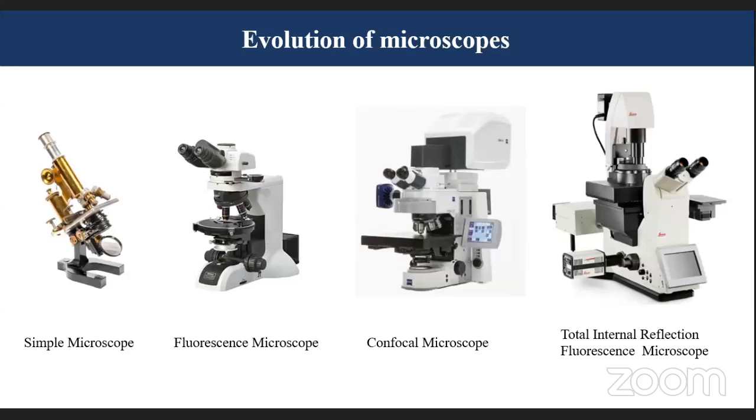In order to refine it further and reach higher axial resolution and spatial resolution, more advanced microscopy methods like confocal microscopes and total internal reflection fluorescence microscopes have been developed. You can see that as the complexity of the microscopy increases, the setup is getting more complex and bigger and bigger.